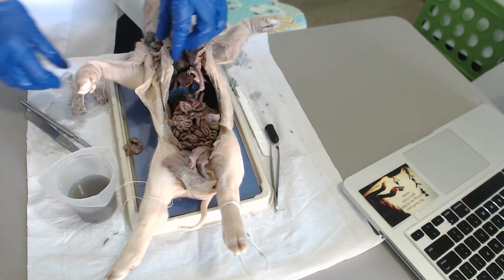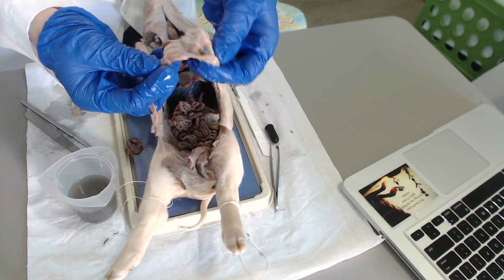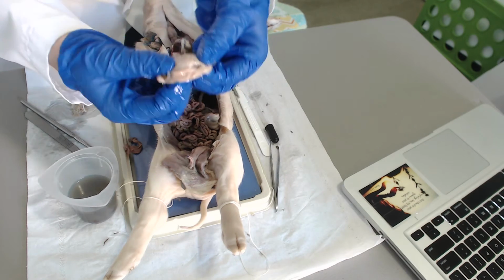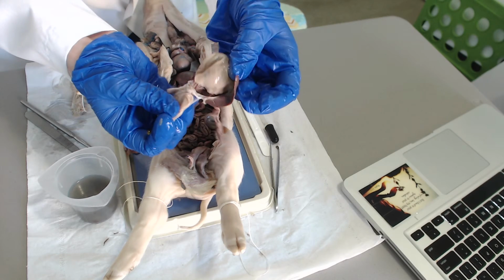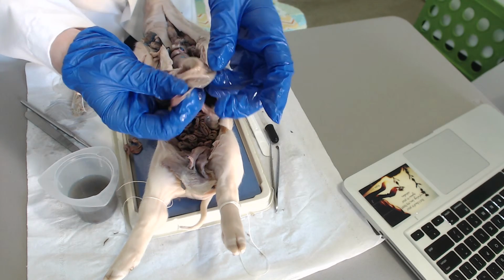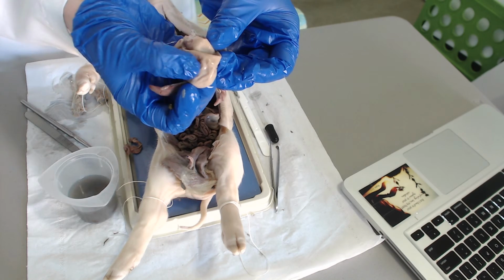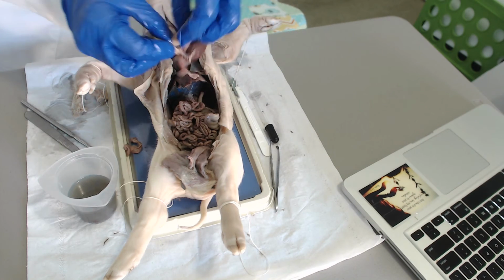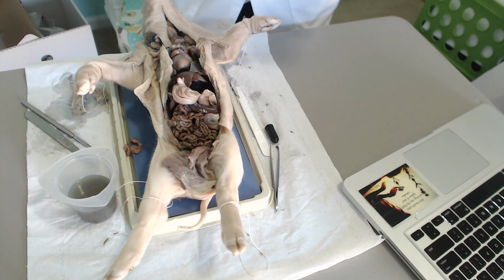Okay, and again, the stomach, the inside of the stomach. There's different folds in there. You can kind of see a little bit better right here, the different folds, almost like ridge-like. Okay, and that completes our portion of the fetal pig dissection.